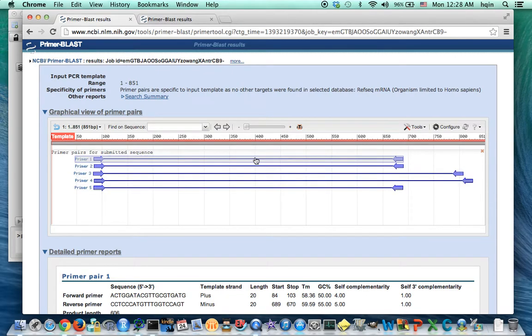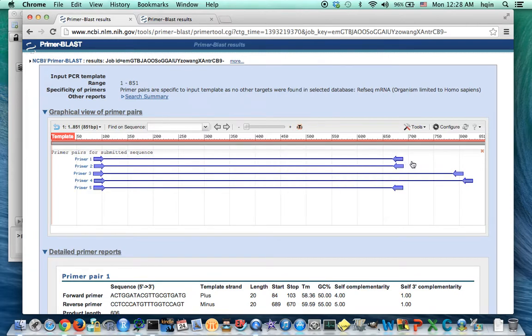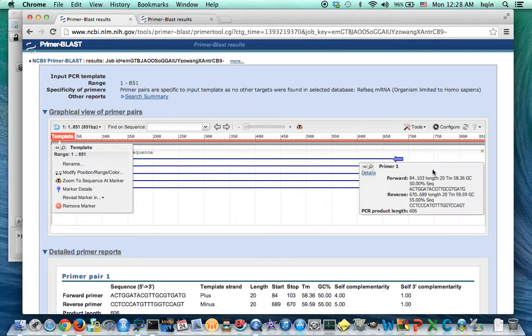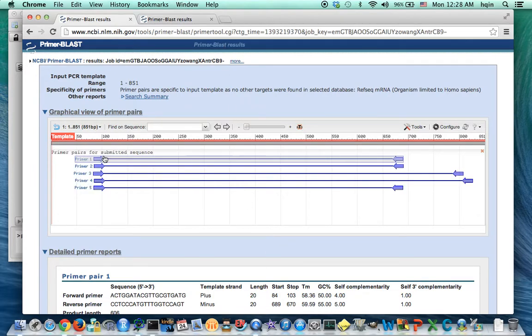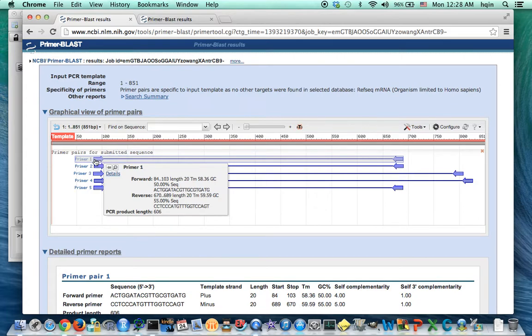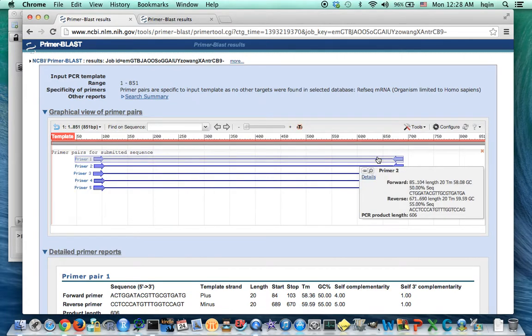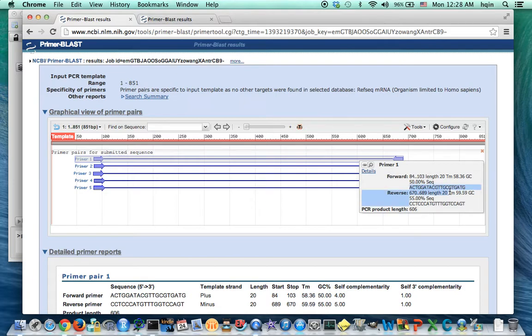So if we use the first set of primers on the wild type and the mutant plasmid, we are going to amplify the region. This is a long piece. This is about 600 base pairs. So this is about 606 here. And the forward primer is here, reverse primer is there. So I'm going to label those primers using APE.